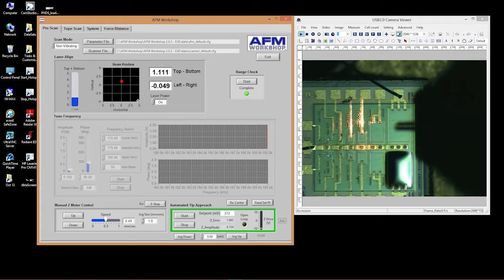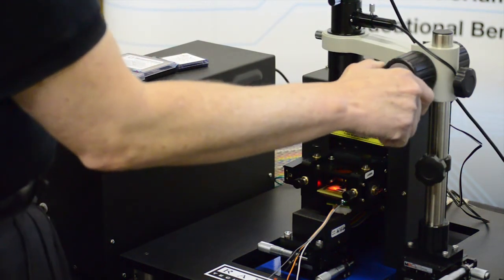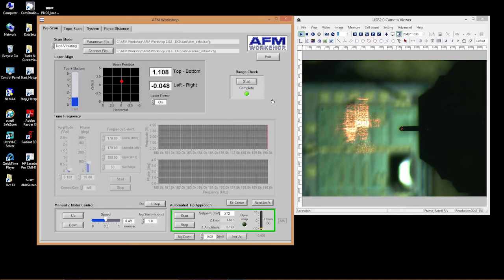I check the position of the laser spot on the cantilever — it's positioned at the tip, passing through the cantilever to hit the surface, giving an idea of how high we are above the sample. I prepare the GUI for tip approach. As a precaution, I always set the manual Z motor control to a one-micron jog size so that if I accidentally hit it, the cantilever only moves one micron and won't jam through the sample surface or break the cantilever.